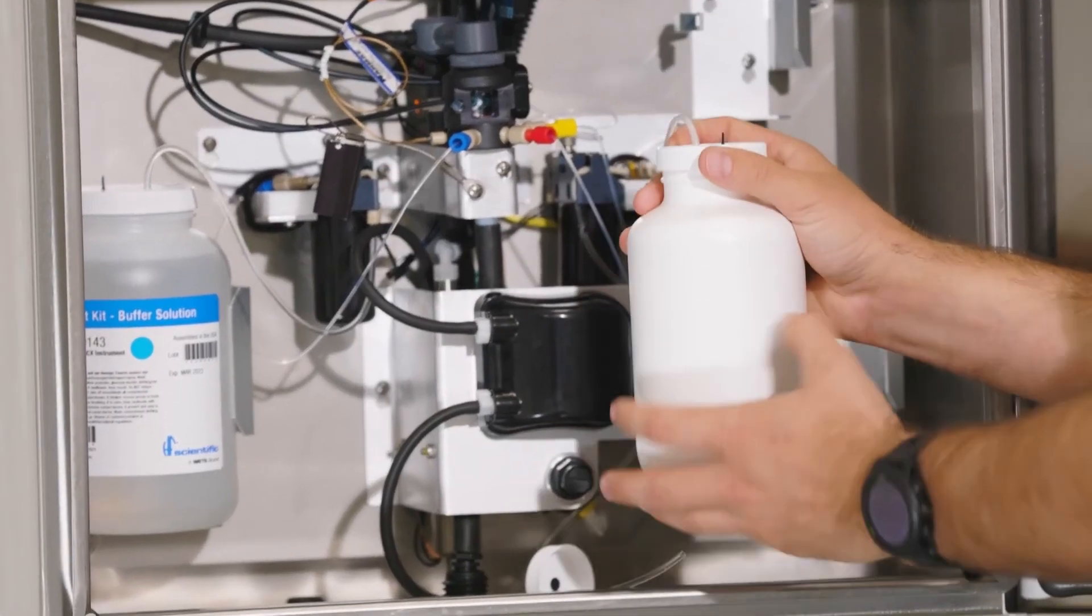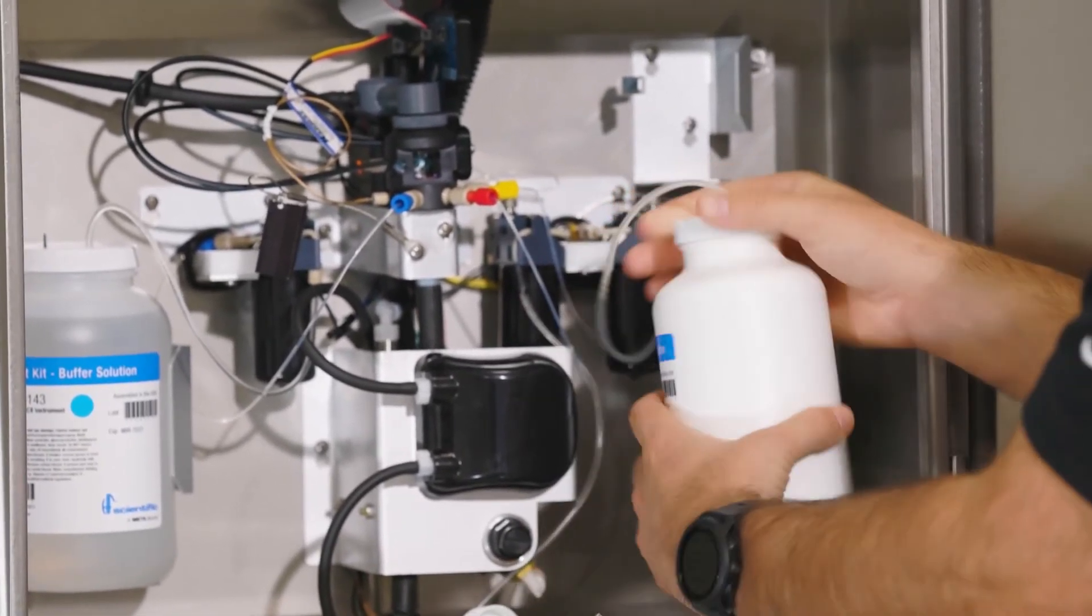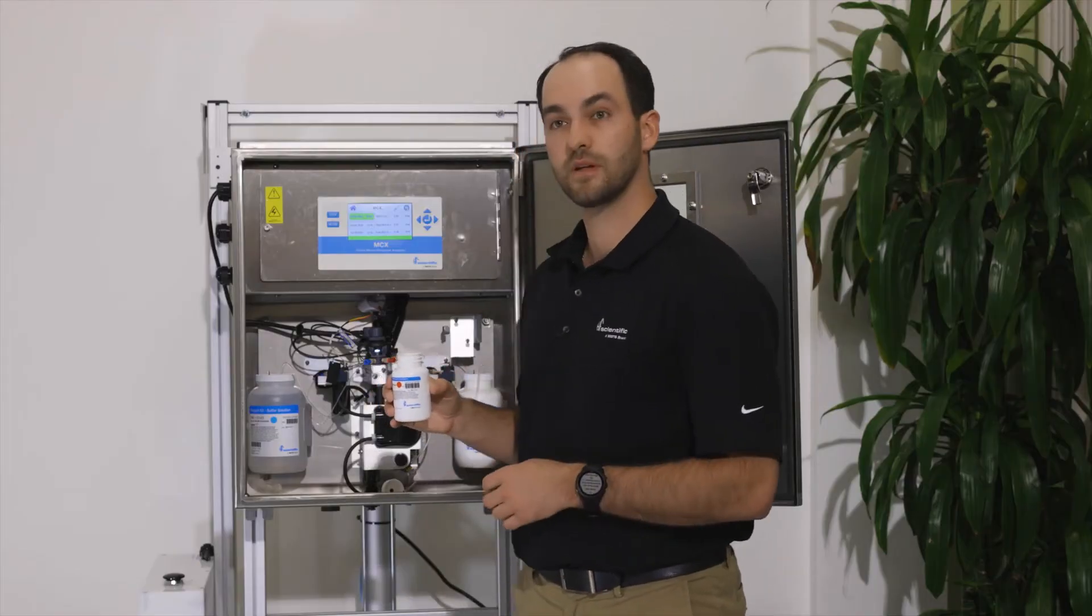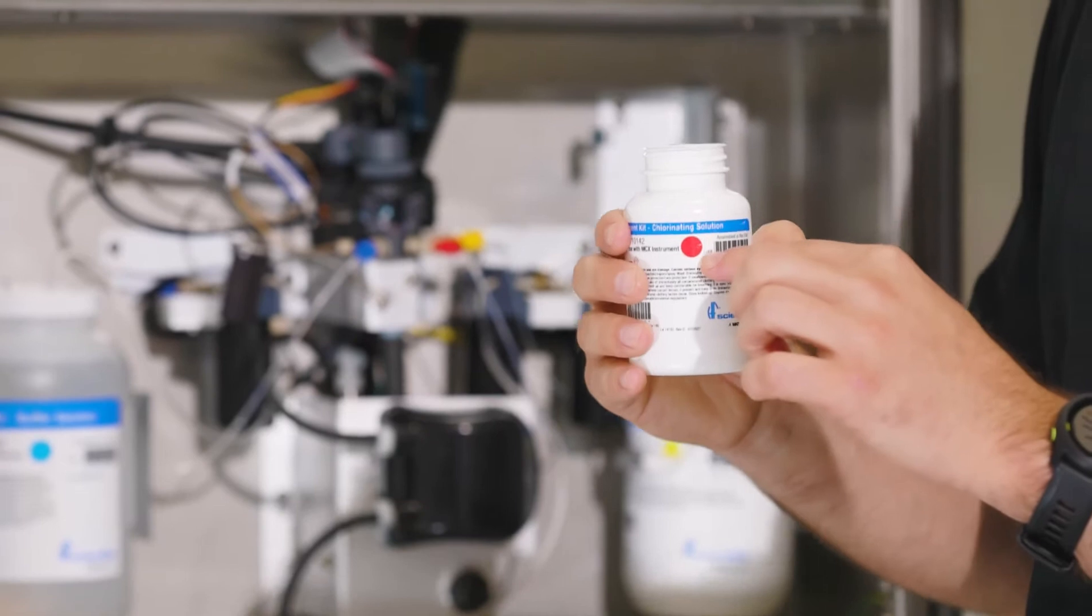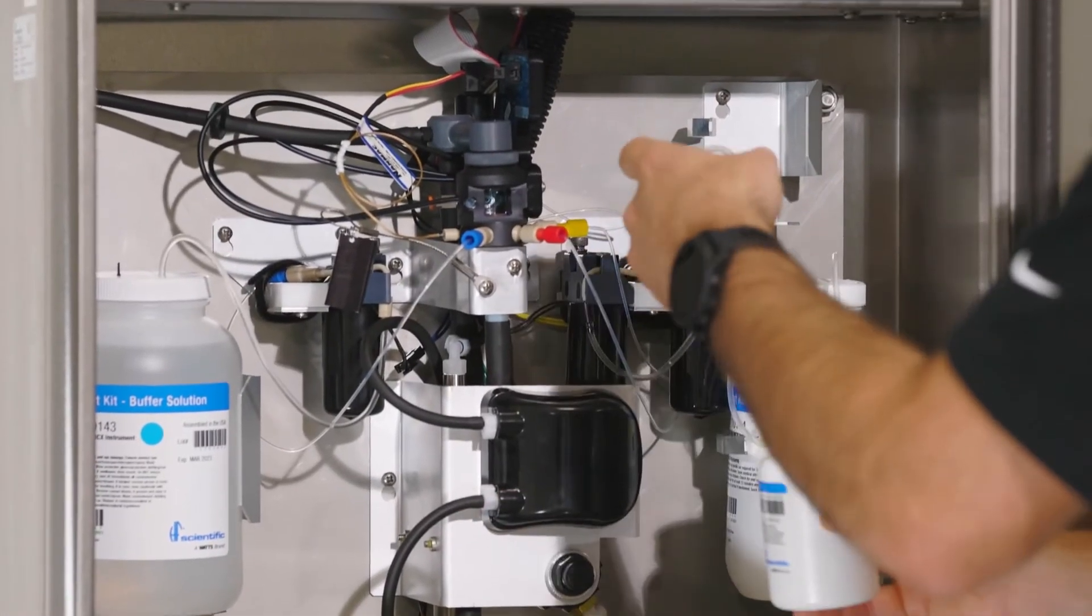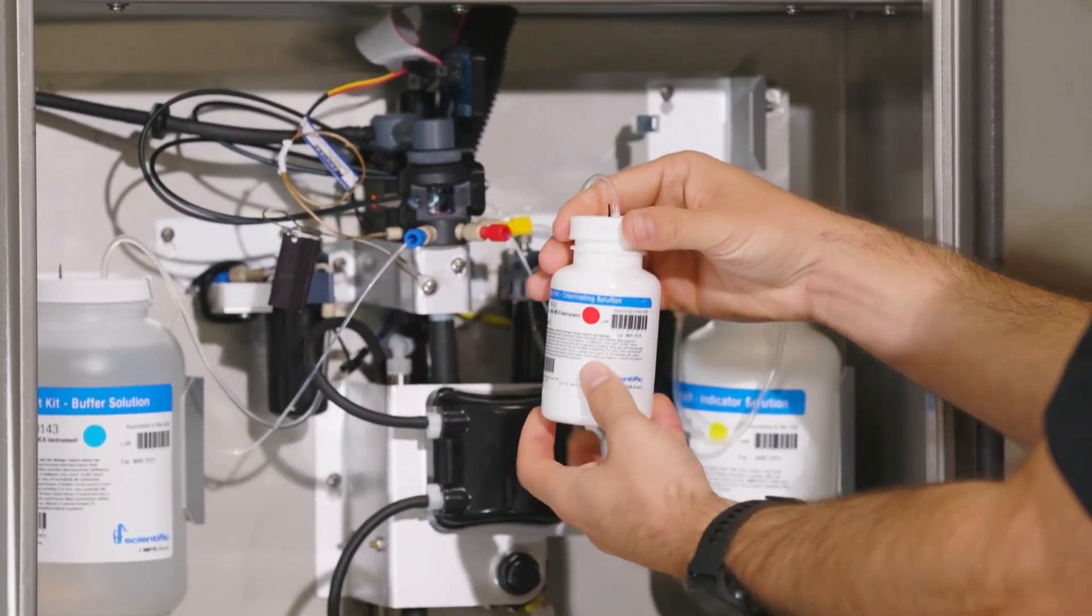Again, hold the cap and twist the bottle into place. The last reagent we'll put in is our chlorinating solution. Again, the red dot to the red plastic. Hold the cap and twist the bottle into place.